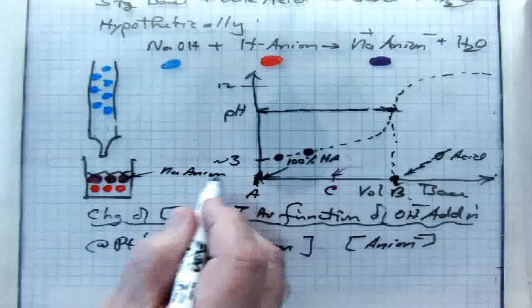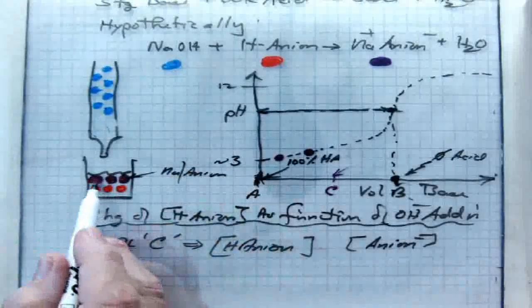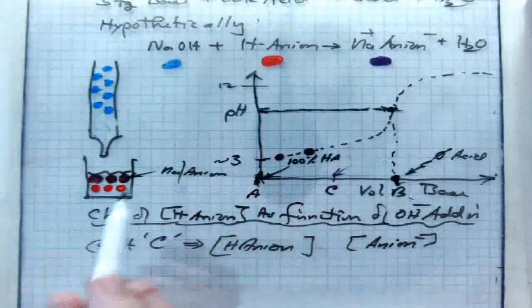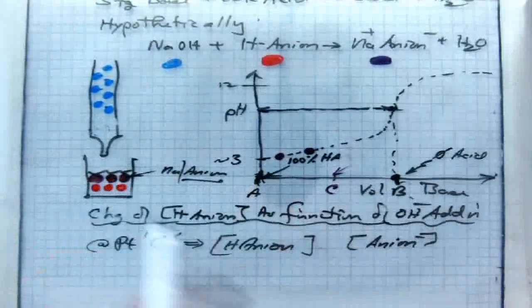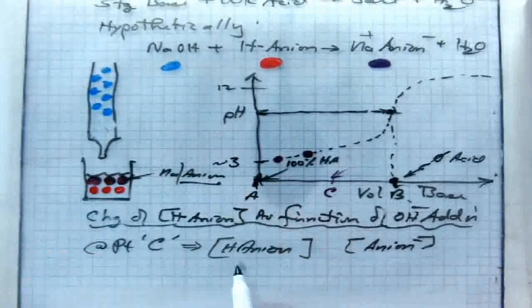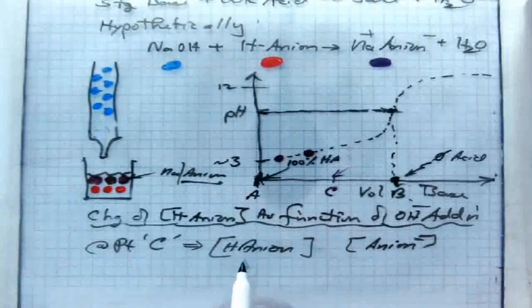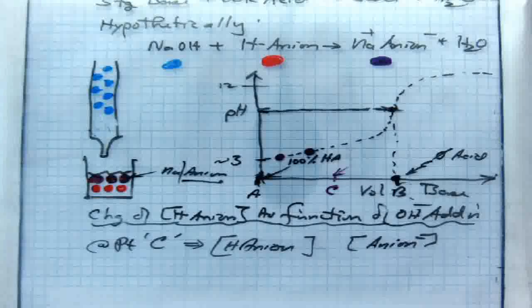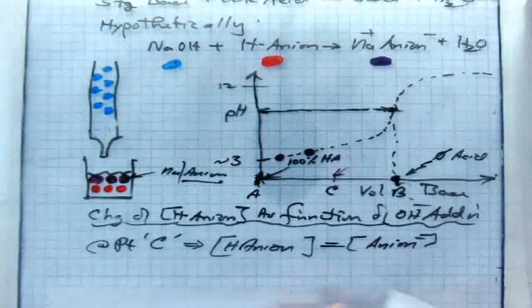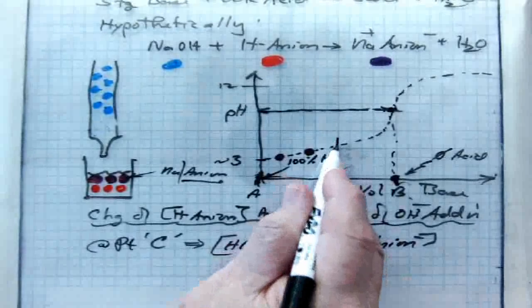Well, we continue the titration and you have to generate the entire curve. Now be sure you understand what I'm talking about, because some of you in the last startup didn't even get to the equivalence point in that titration. You've got to get not only to the equivalence point, but I want to see the upper end of the shoulder up there. So when we add 3 more of these, we're at the equivalence point, right?